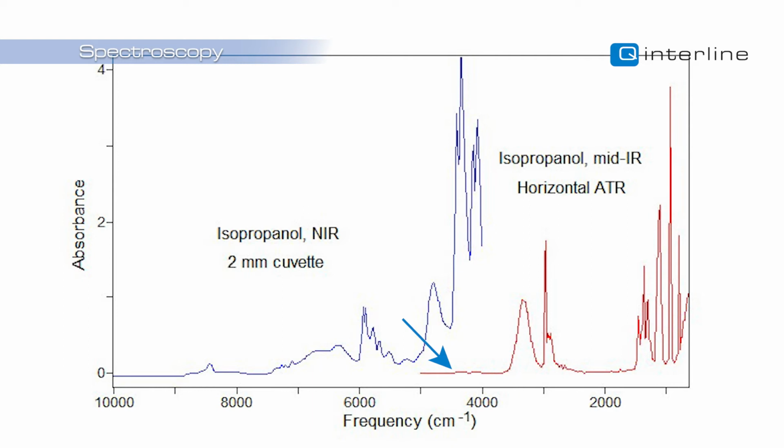And we see that these small noisy things rise to the occasion and become real peaks. We still have the OH band, CH band, and the like, slightly broader, slightly less detailed to the naked eye, but if we do pre-processing of the spectra, we have exactly the same information. They are just weaker overtones of the fundamental vibrations.